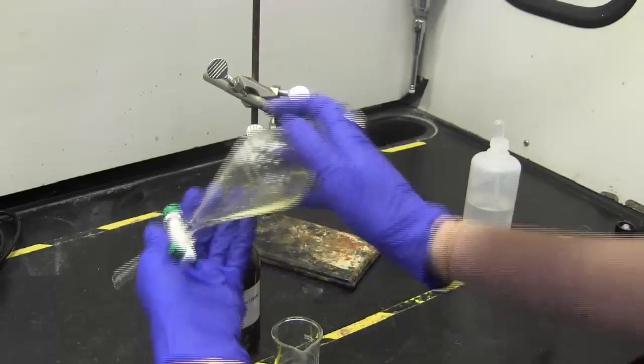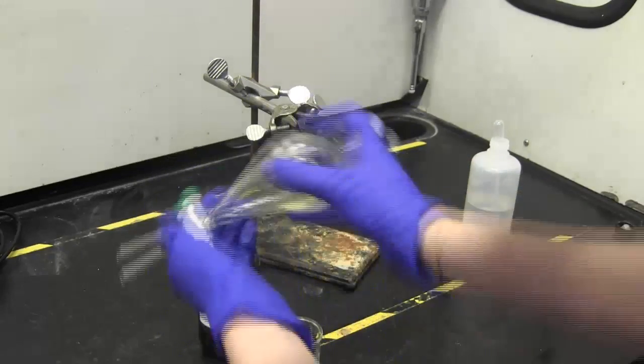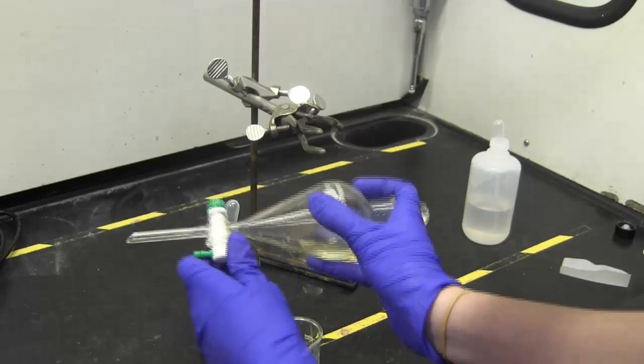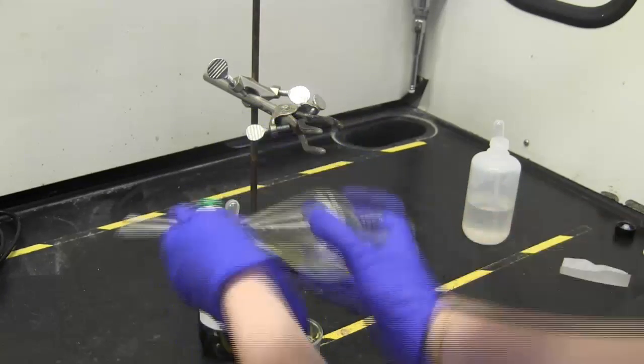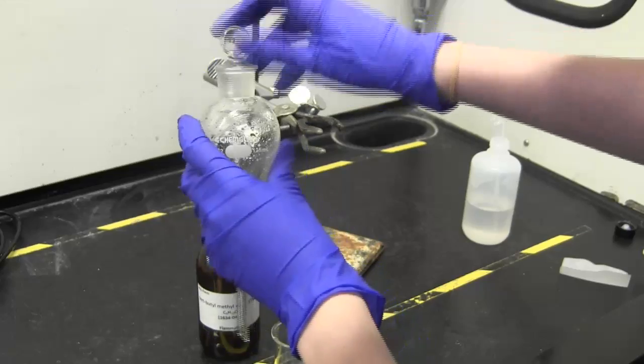Also, be sure to hold the cap in place. Then gently rock the funnel while holding it with both hands to thoroughly mix the layers. After shaking, hold it upside down and open the stopcock to vent out some of the vapors in the funnel. Repeat this three times.